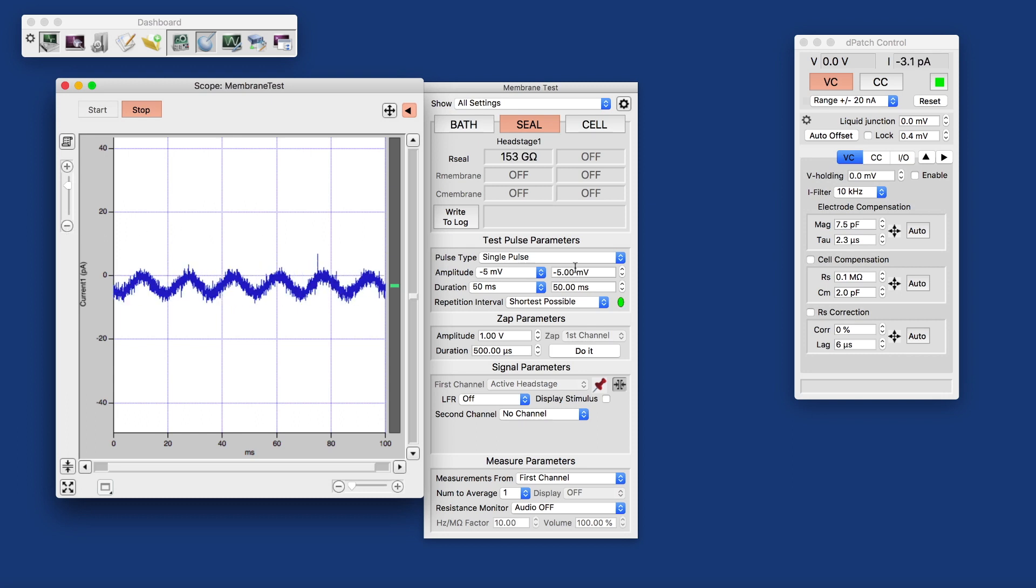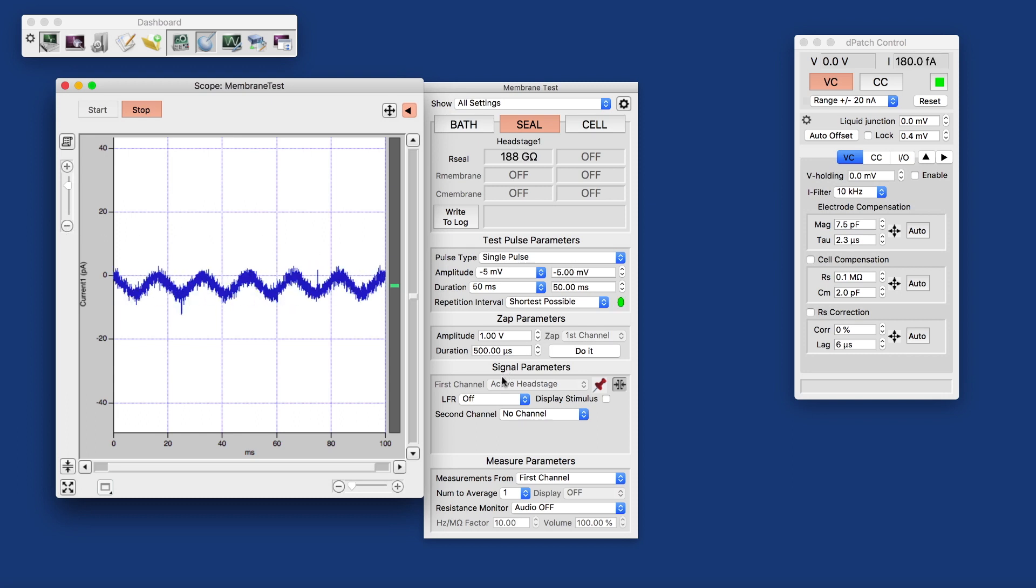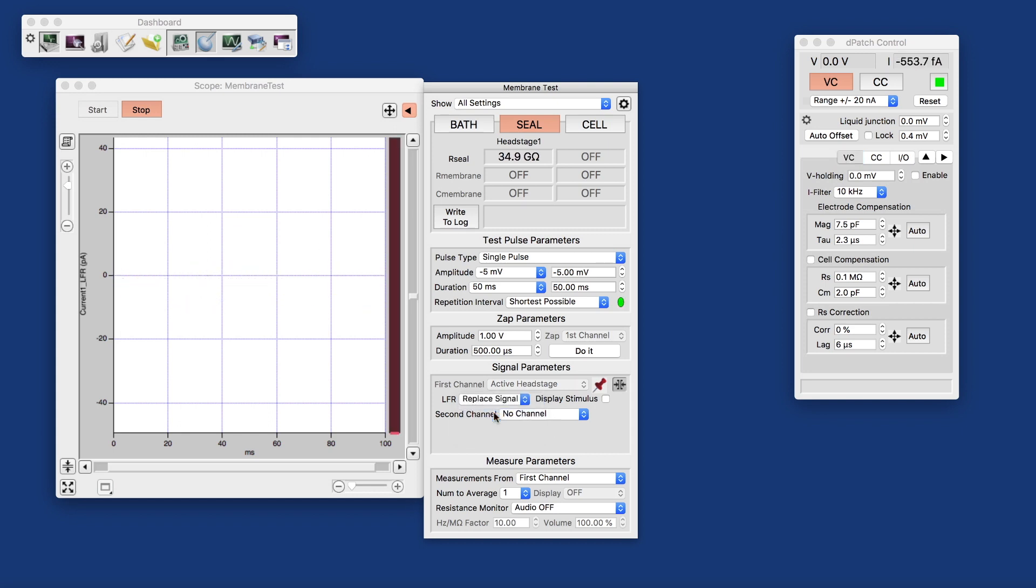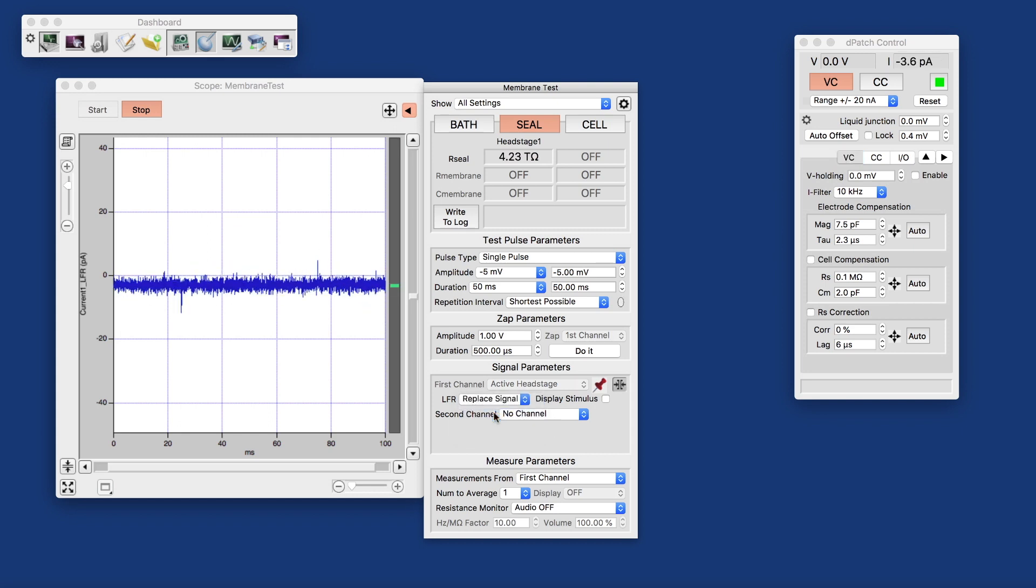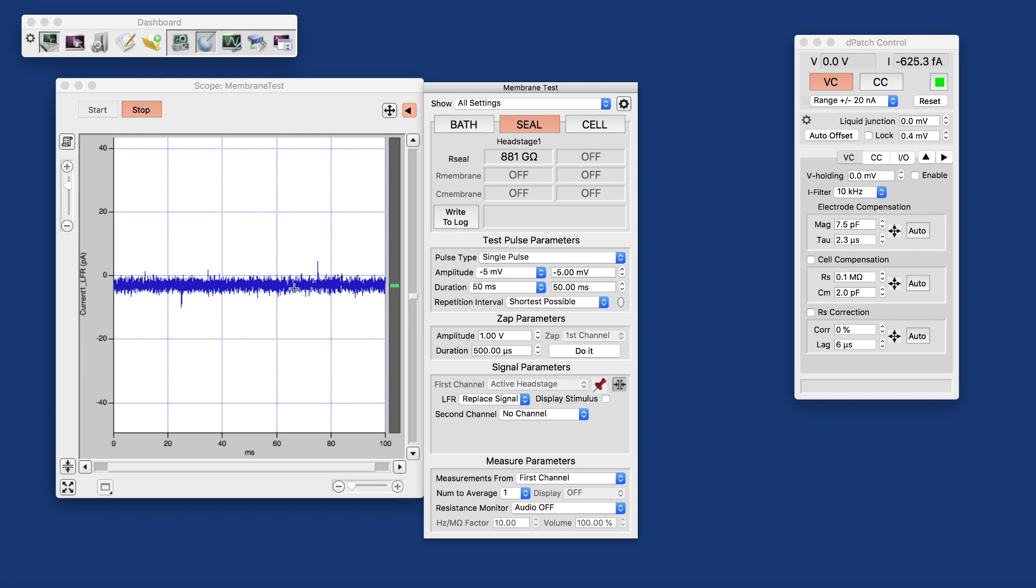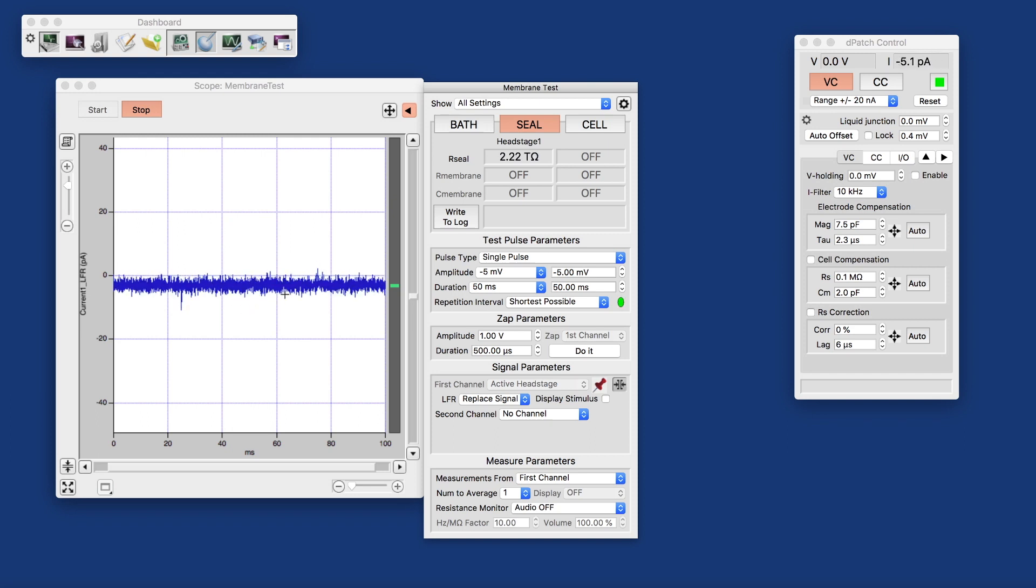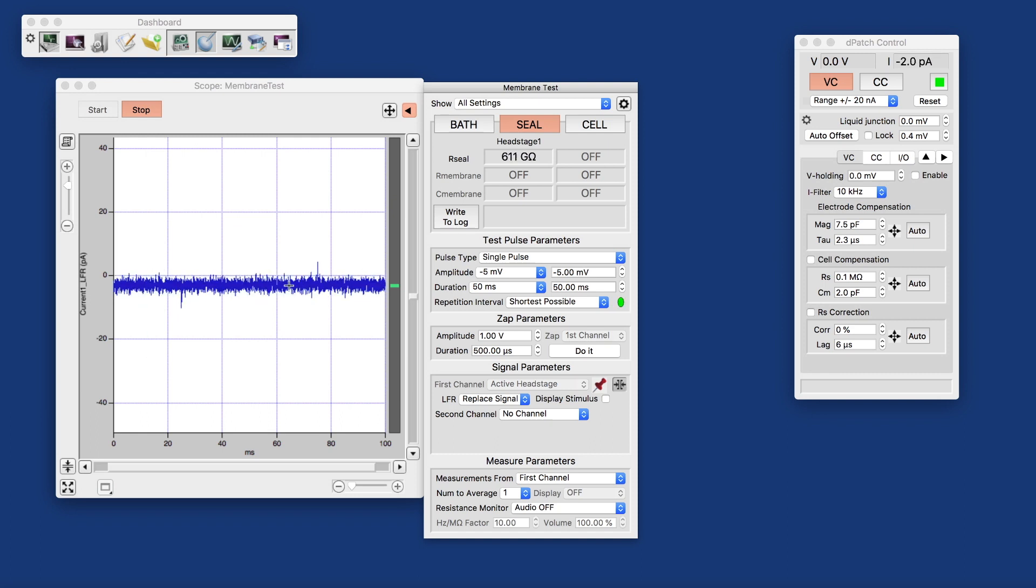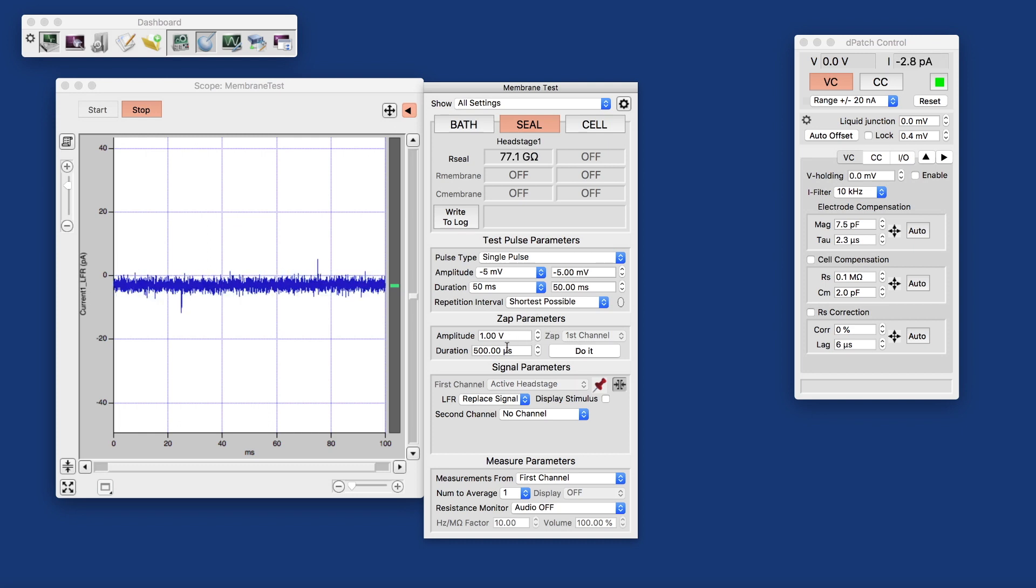What we also may want to do here is enable the line frequency reduction, and we just want to replace the signal. And that is a software algorithm that pretty elegantly completely eliminates the line frequency that we're picking up here because we're holding the cell just in a room that's not shielded or anything.